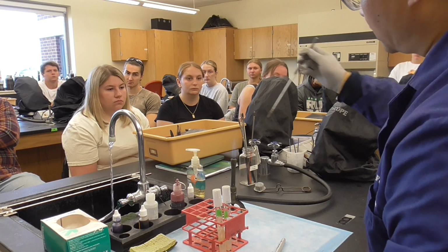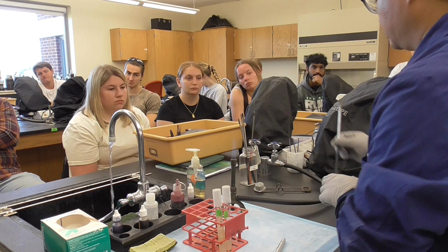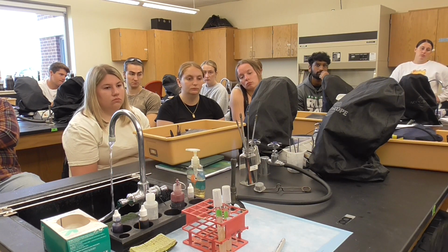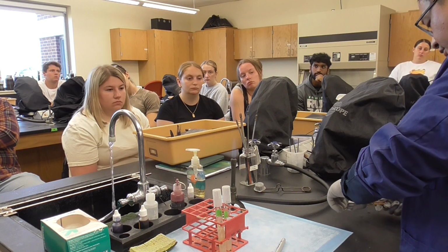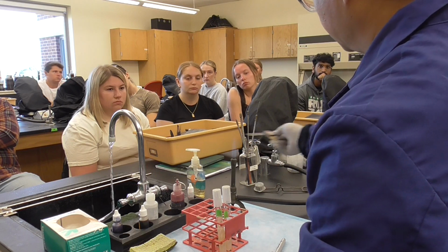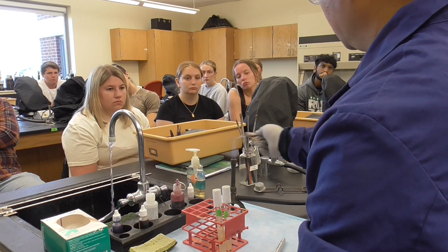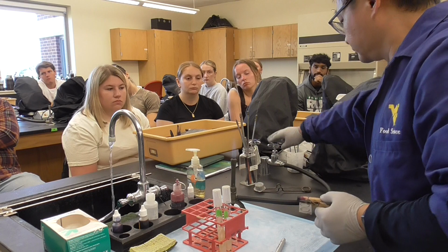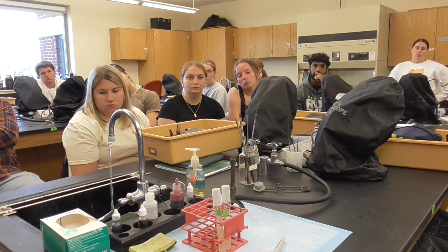Okay, now we need to do air dry. So flame the loop. This is not going to be used. We're going to do air dry. Let's say the air dry time is ready. We're going to do the heat fixing. So the heat fixing will be real quick on the top a couple of times. I mentioned it's not like cooking, but we have to make sure it's heat fixed, okay? Let's say heat fixed. So we turn this off, and then go this way.